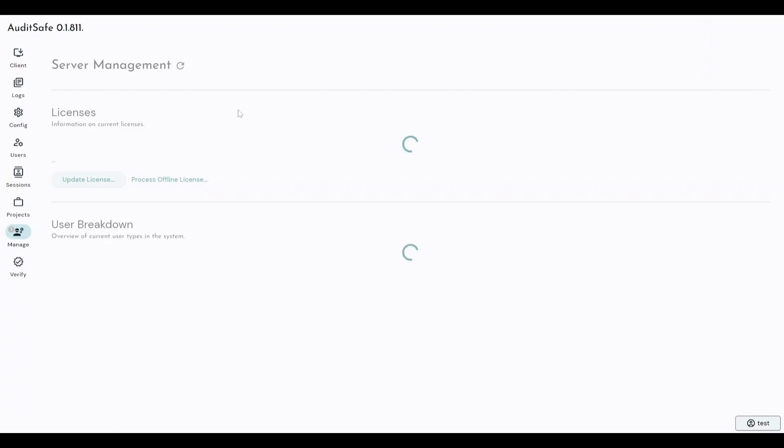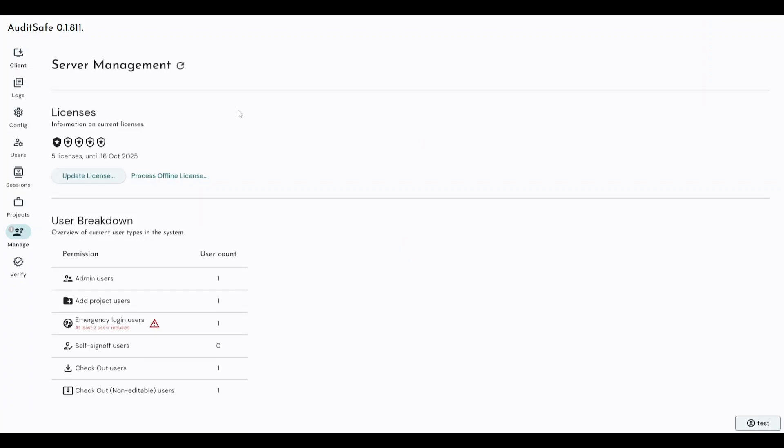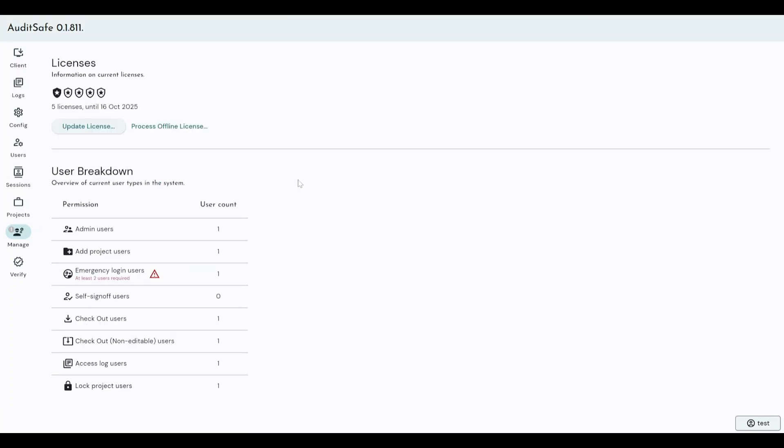The manage tab is where you perform your server management, where you would perform your license management, and it gives you a breakdown of all of the users and all of the permissions that those users have within the system.